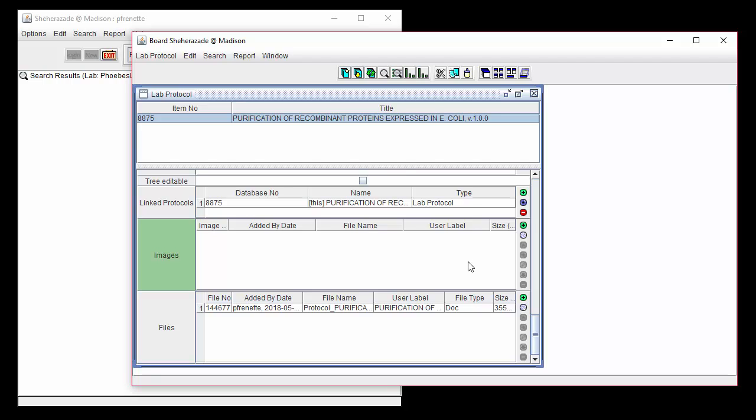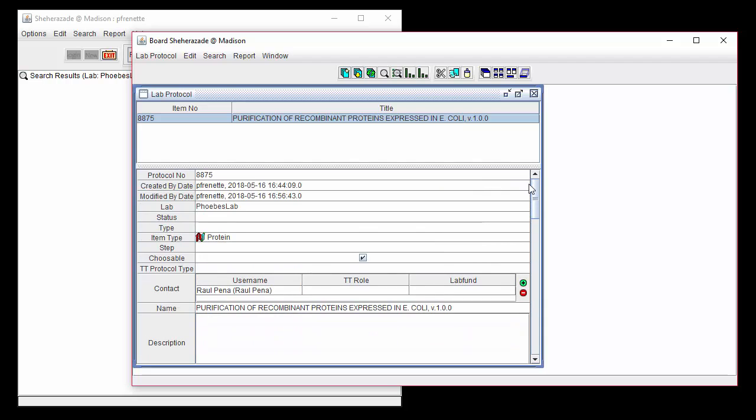As you can see, users may quickly create protocols in Sesame from existing files and whatever your lab may already have. Only a minimum number of fields need to be completed. Labs may easily make improvements in existing protocol records.